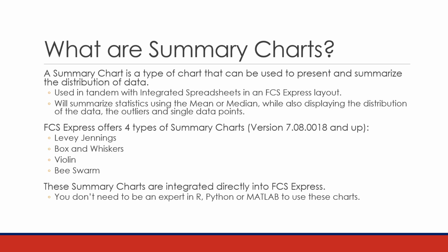Typically we're talking about statistical data. Whether you're looking at percentages, or the mean or median of various populations, you can use these summary charts as a way to graphically represent this information to your audience. These summary charts are used in tandem with the integrated spreadsheets in an FCS Express layout.